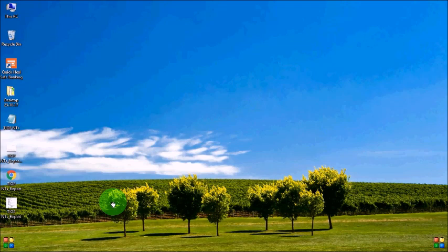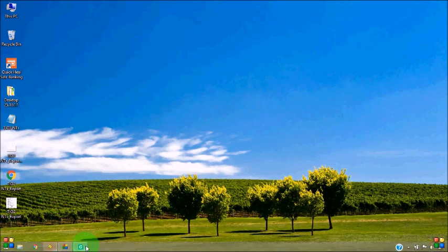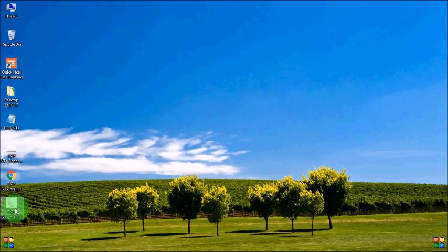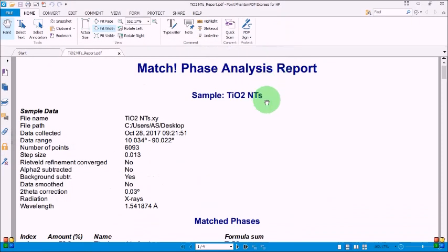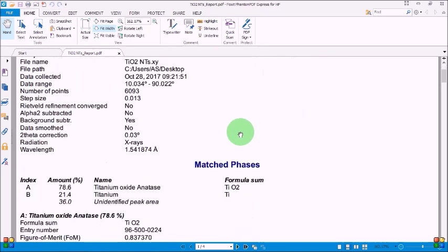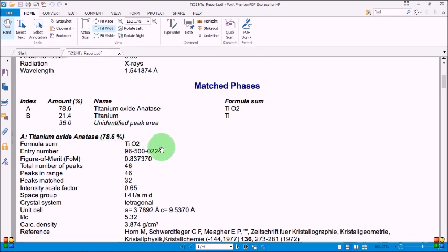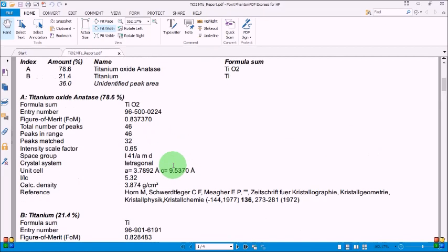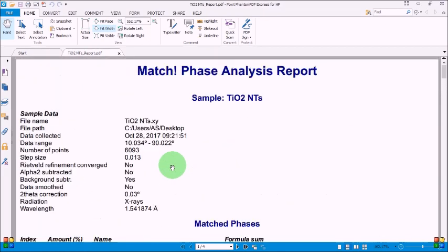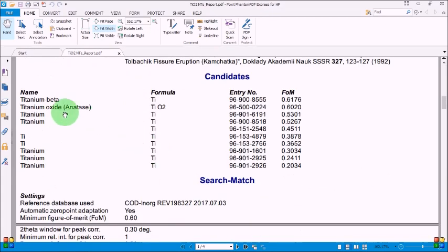And if you are writing your paper using word then it is also fine. Let's see the pdf version. Oh what has happened? Something has come wrong. Yeah, you can see the comprehensive data sheet analysis report is here. Formula sum A will represent TiO2 this 78.6 percent and titanium is 21.4 percent of the data and entries are there also and this formula matching.